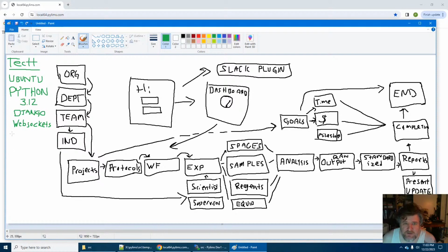So this is kind of like back end, and then front end we'll just be using HTML, obviously. A lot of JavaScript. WebSockets to communicate back and forth. Ajax, obviously. And a shitload of JSON.